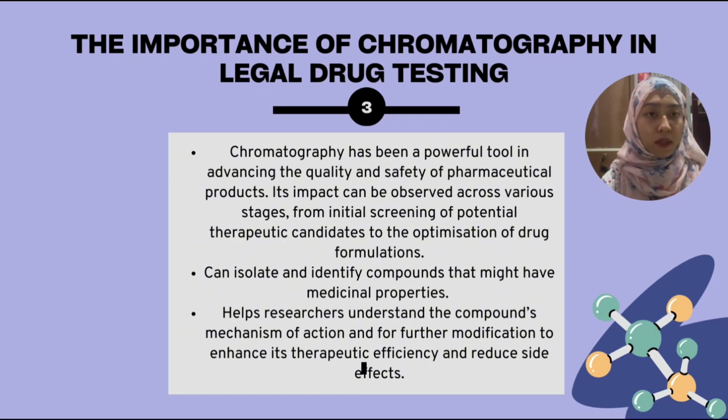Chromatography in drug development has been a powerful tool in advancing the quality and safety of pharmaceutical products. Its impact can be observed across various stages, from initial screening of potential therapeutic candidates to the optimization of drug formulations. Chromatography can isolate and identify compounds that might have medicinal properties.